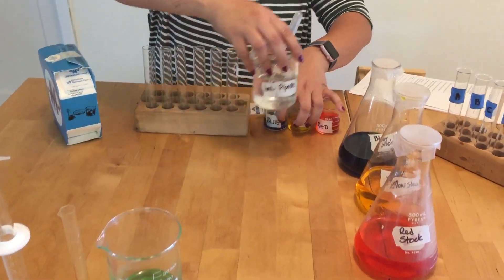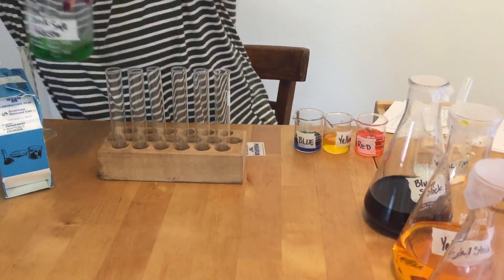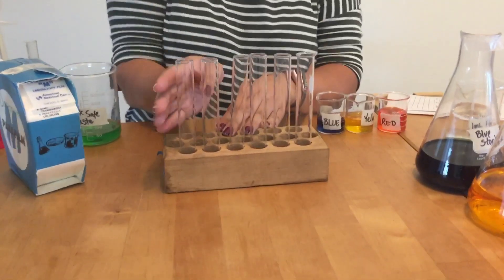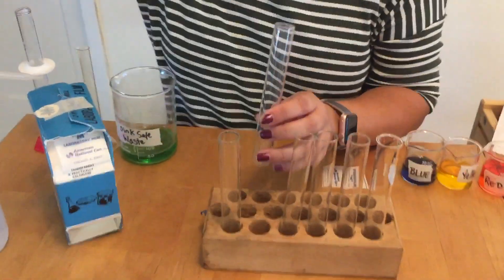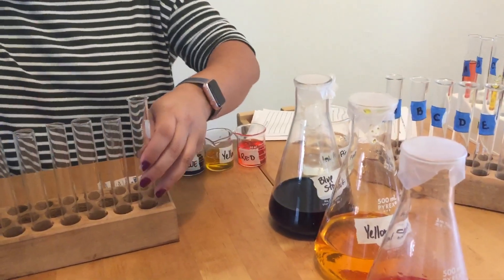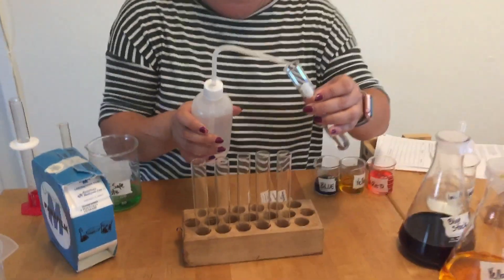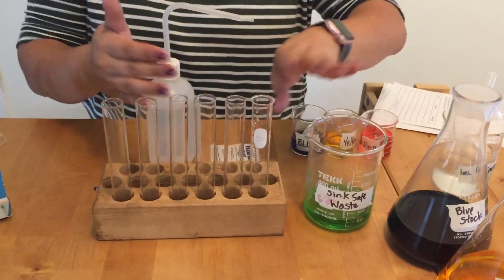We're going to go ahead and start the procedures. Number one: somebody in your group needs to make sure that all test tubes are clean. If there's stuff on the bottom, you're going to have to wash it out with the test tube brush and soapy water near the sinks. If you can rinse it out with the wash bottle, spray around — notice the tip is not actually touching the test tube — and then pour the rinse into the waste. If there are still little grits on the bottom, you'll need to wash it.